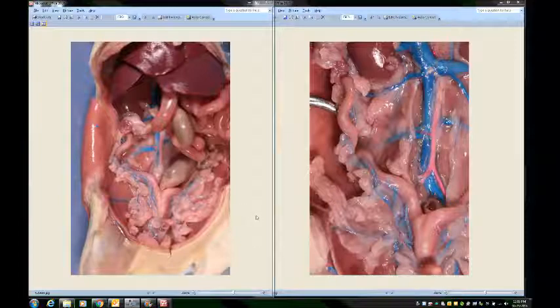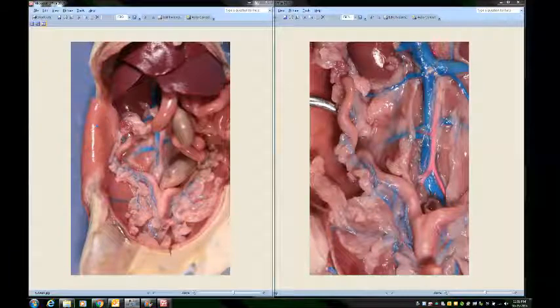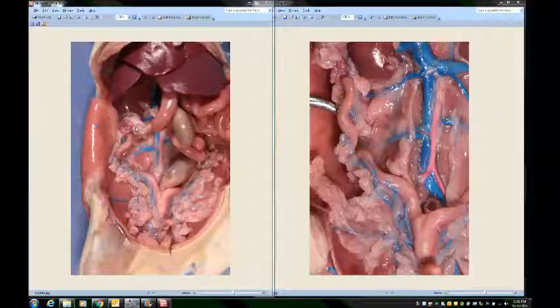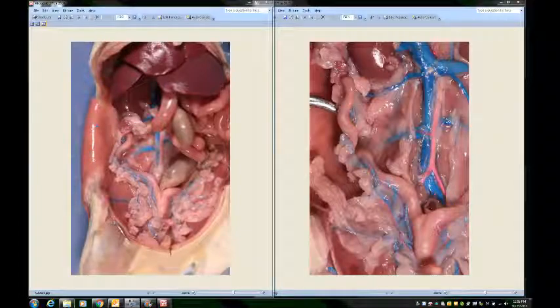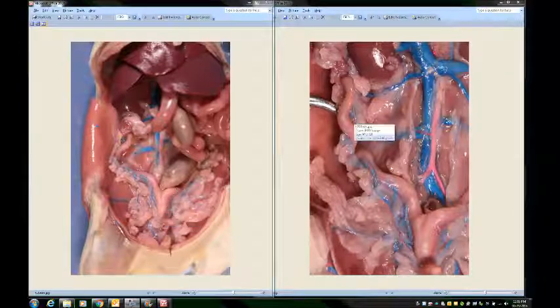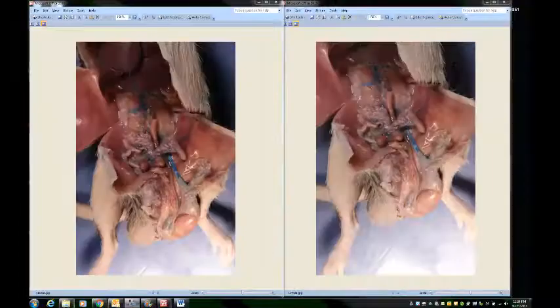For a rat the anatomy is different because humans are not having eight to ten births at a time. At the end of the uterine horn you see a brighter, roughly circular organ covered in fat — that is the ovary. The uterine horns and the organs at the top are covered in fat for cushion, support, and protection, so that when a pregnancy occurs there is extra protection for the pups. You'll have one ovary on each side. The ovary and the uterine horn are the main parts of the female reproductive system you will need to identify.